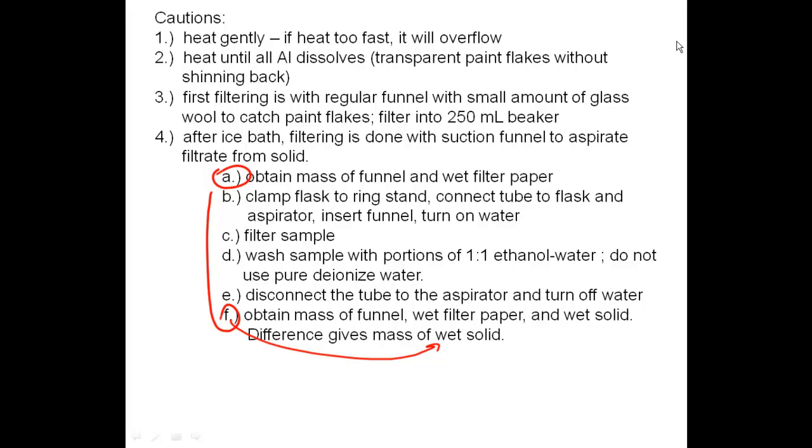Now, that's the number that we're going to use as our final product mass. Now, do I have an error in this process when I go to do my percent yield? The answer is yes, because I have a wet solid. That wetness has mass to it. It's water mass. So I don't have the actual mass of just my solid, so I'm going to get poor results from that calculation. That's something you need to note in your lab report, because there's a possibility you may get greater than 100% product because you have water there. That's why that's happening.